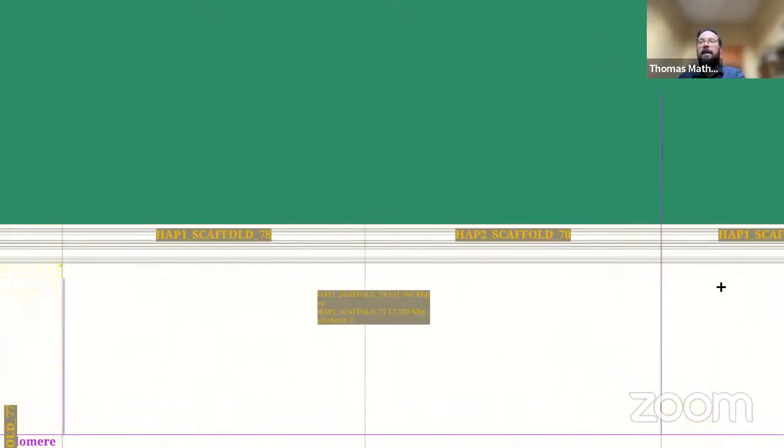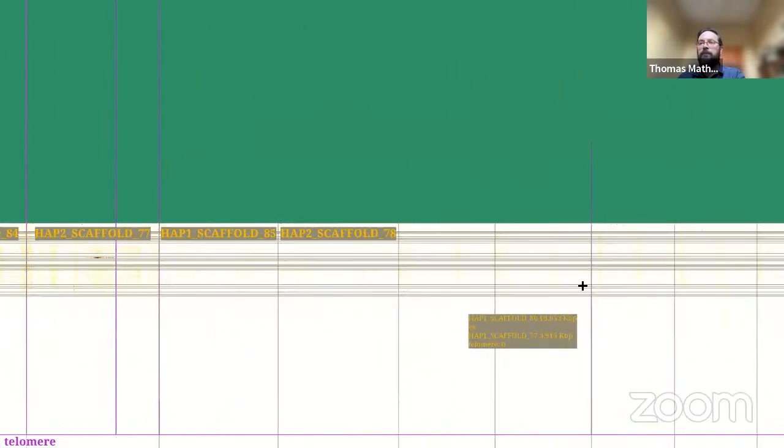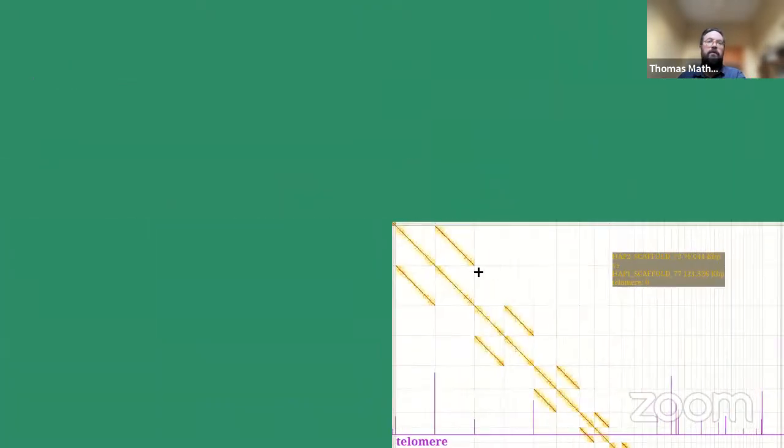Okay. And so what we're looking for is basically joins that we can make to join some of this content together into individual chromosomes. And if you look across the map, you can see that these candidate microchromosome scaffolds are fairly unique in the sense that they don't look like they go anywhere else. They belong with each other. And if I just go into the shrapnel contigs, they are hitting some of these repeat-like contigs as well. So we might be able to drag in extra sequence into these as we start to build up the chromosomes.